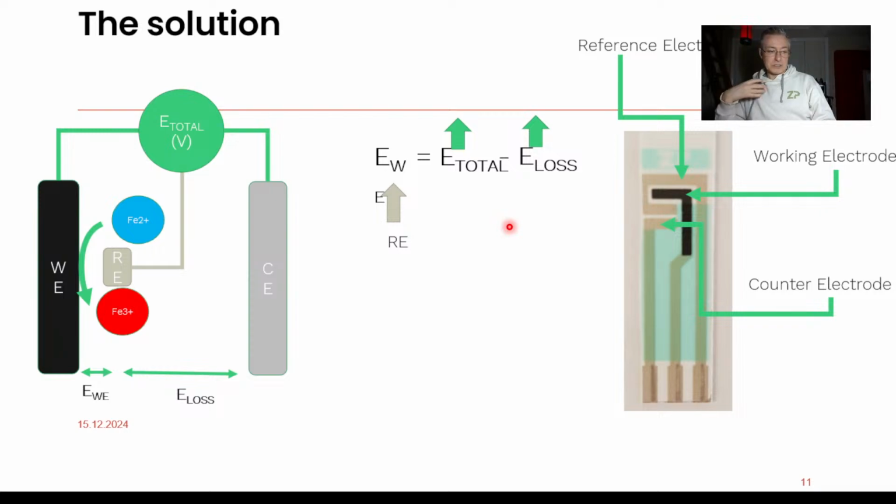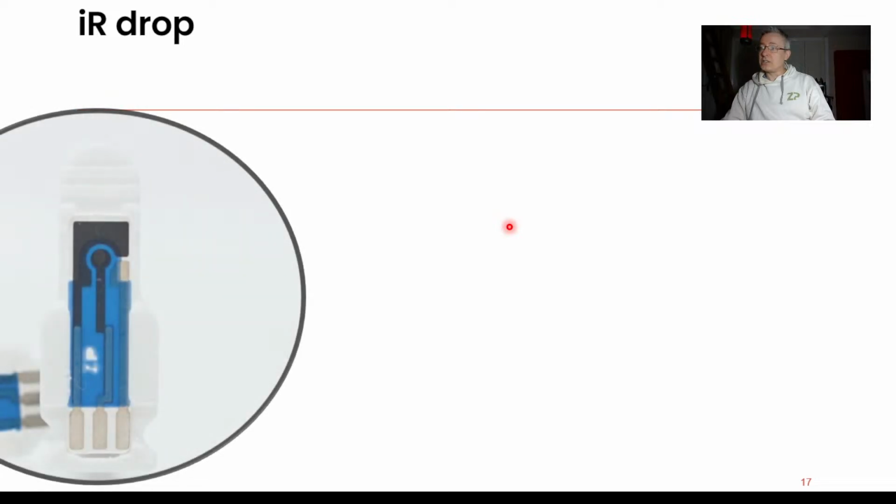We still use potentiostats at ZP. We sell and make potentiostats, but it's an interesting point when answering this question: the idea of needing a 3 electrode system versus a 2 electrode system becomes less critical when you do have a very controlled electrochemical cell like a screen printed electrode.